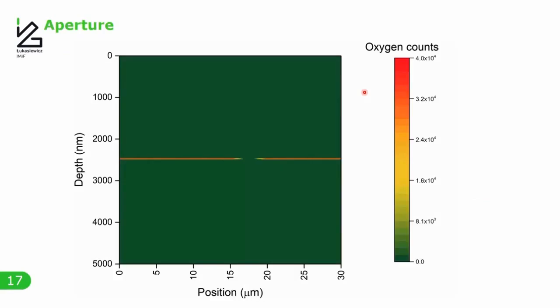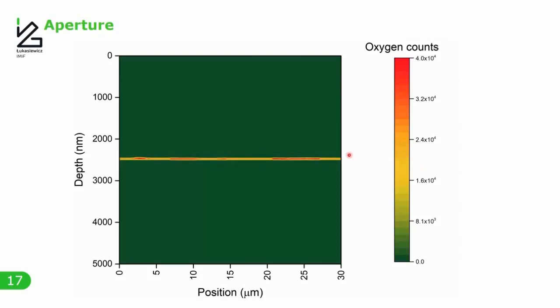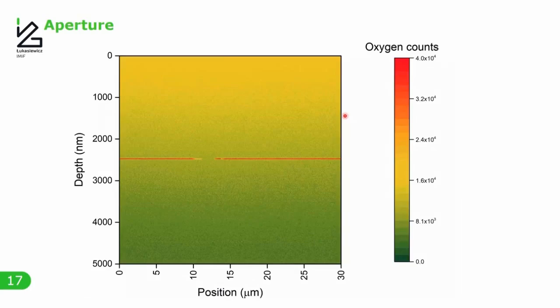So first of all, let us see how the oxidizing layer is forming the aperture of such a laser. For a good laser, we can see a very nice formation of this aperture. So we basically get the operating laser. In those which were not operating at all, we saw that the oxidation process was too fast, and this oxidizing layer oxidized through the whole sample. And in these lasers that were just showing the very weak luminescence, we saw that we did form the aperture, but there was also the oxidation of the full structure coming from the surface. And obviously it reached the quantum well region, and thus the laser action is not present here.